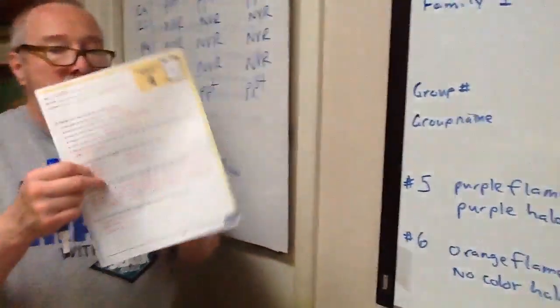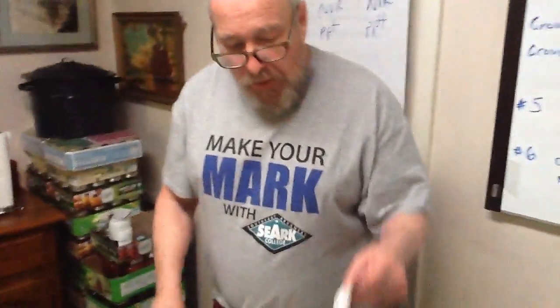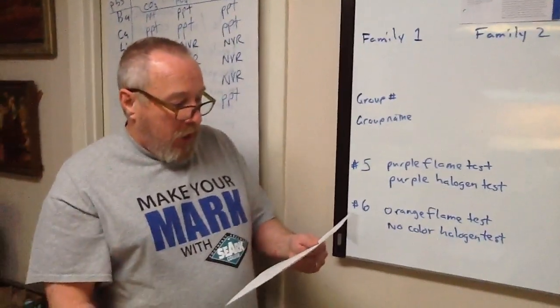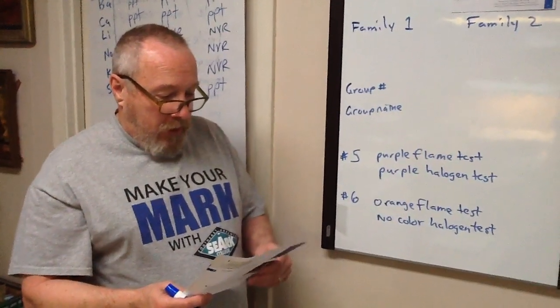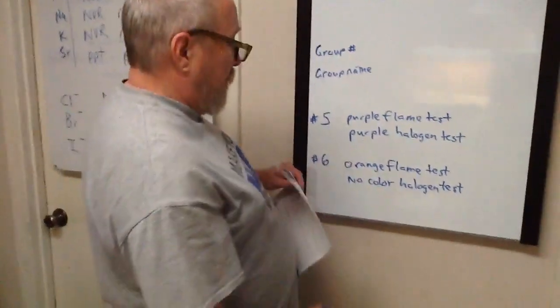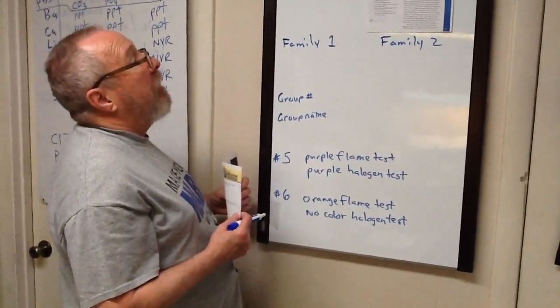Now, the last thing to do is for you to fill in your answers and complete the reflective exercises that summarize our results from the lab, and I want to summarize them for you. I'll let you answer some of them. For example, number 1, going back to the flame test, if you want to get a brick red color, what would you use? That would be calcium, which would look more orange for us and on the copies.